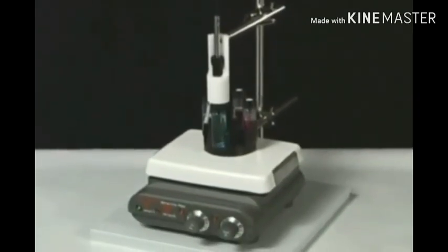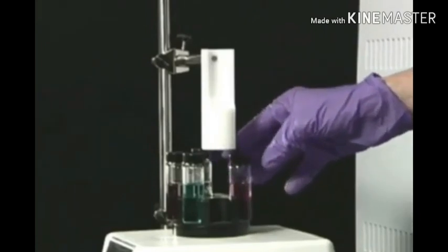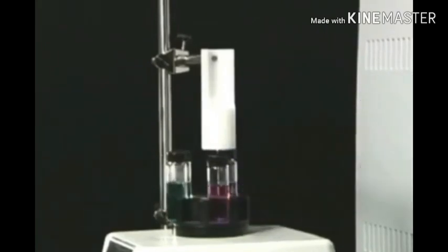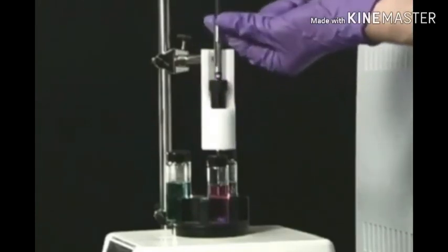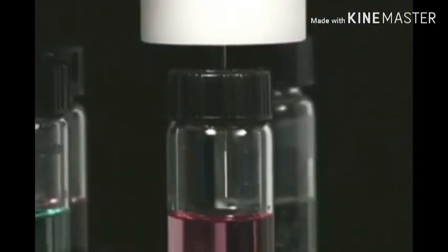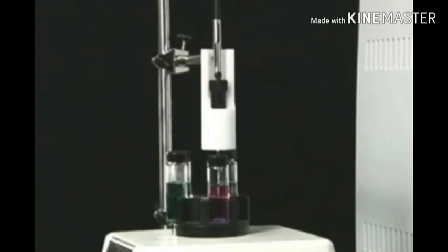Manual SPME sampling analysis. Beginners should consider first using a manual SPME fiber and holder. The manual system allows the analyst to optimize the extraction process by evaluating different fibers and extraction conditions in a consistent manner. Begin the extraction process by placing the sample into the vial puck on the hot plate. The vial puck allows users to easily index the vial to begin sample agitation. Insert the holder into the sampling stand, passing the needle through the septum that seals the sample vial. Depress the plunger down to expose the fiber to the sample liquid or headspace above the sample. Start the timing of exposure of the SPME fiber for reproducible extractions.